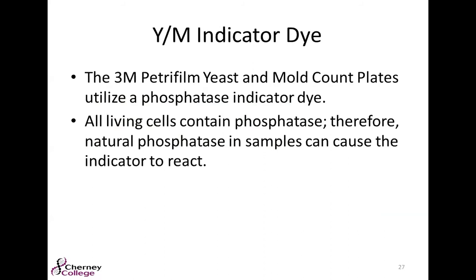Something that can cause issue when interpreting yeast and mold plates is this indicator dye. The 3M yeast and mold plates contain a phosphatase indicator dye, and all living cells contain phosphatase. Therefore, there's a natural phosphatase reaction in samples that can cause that indicator to react.